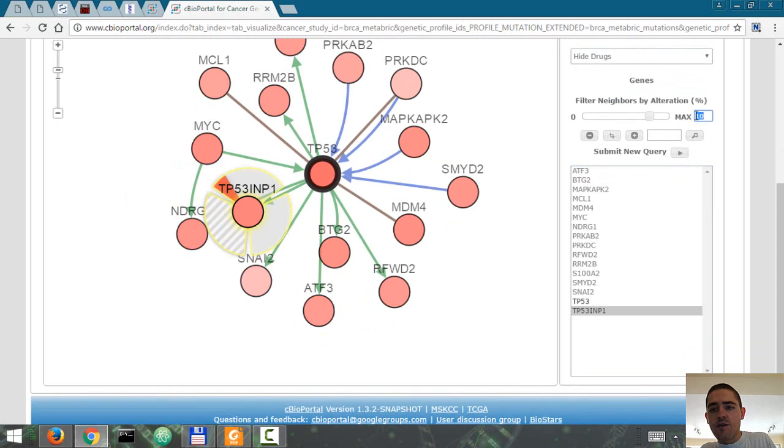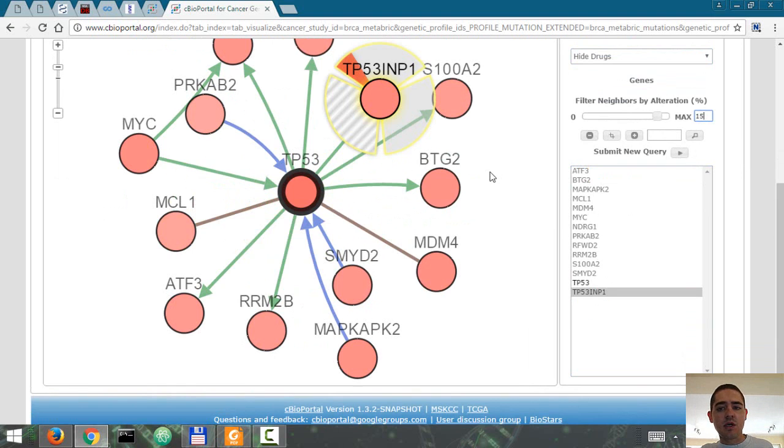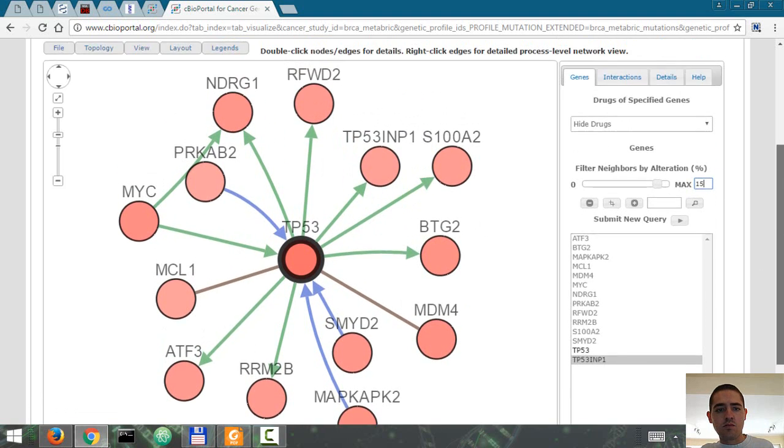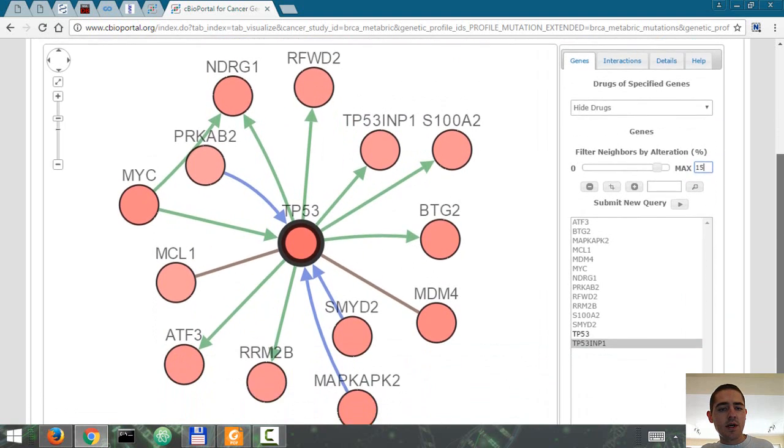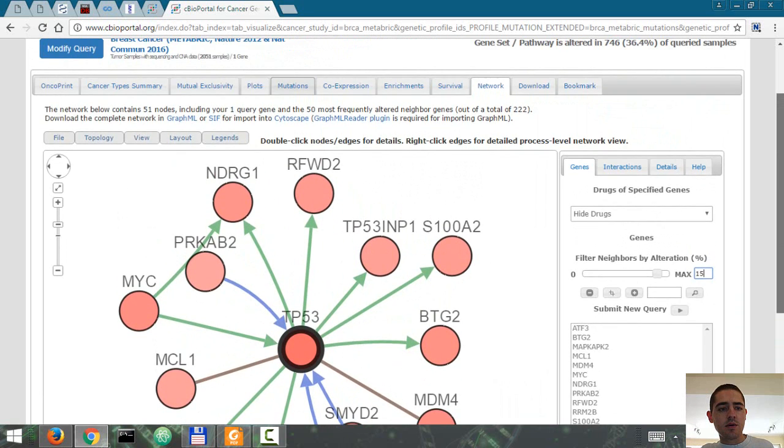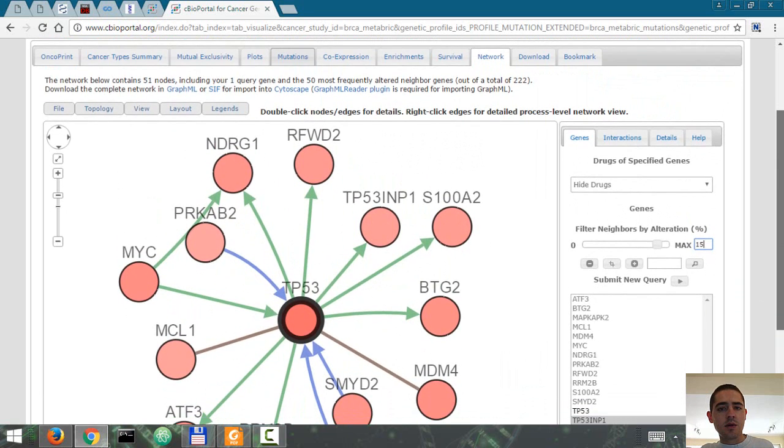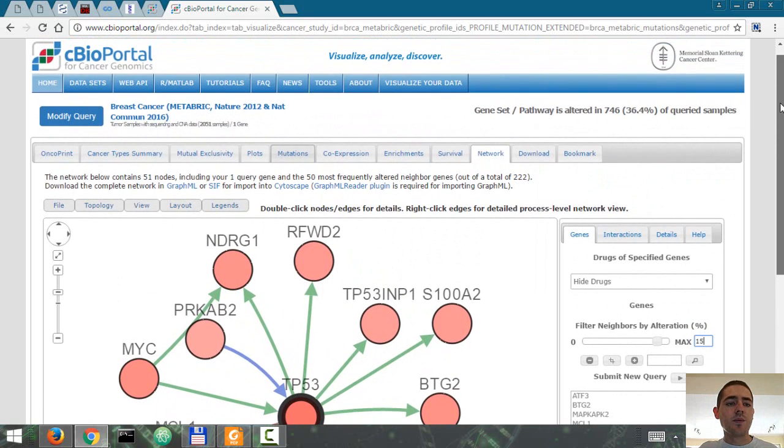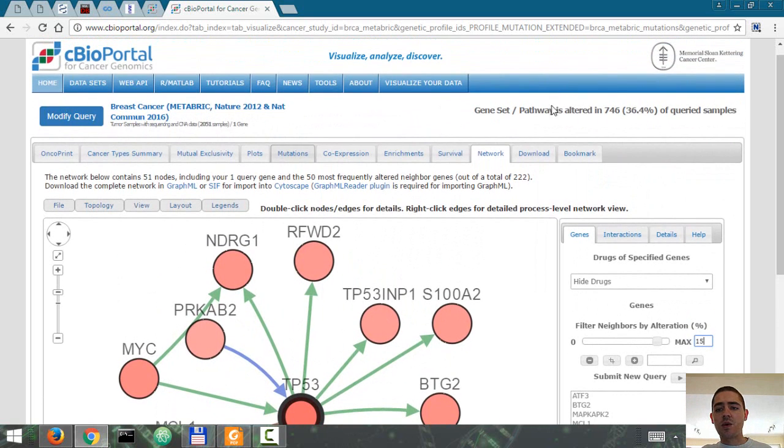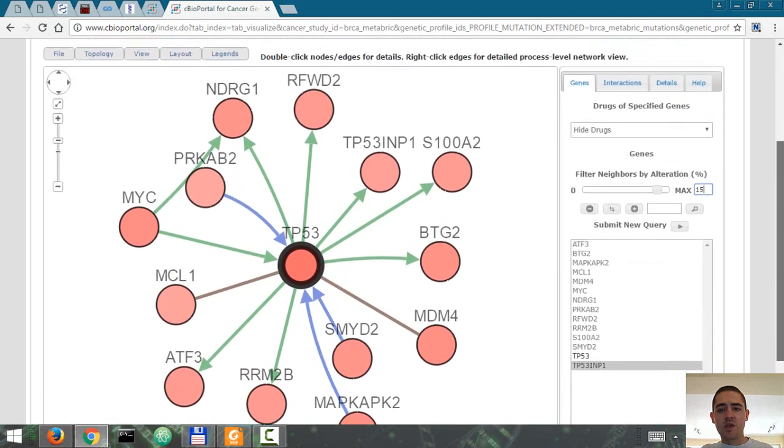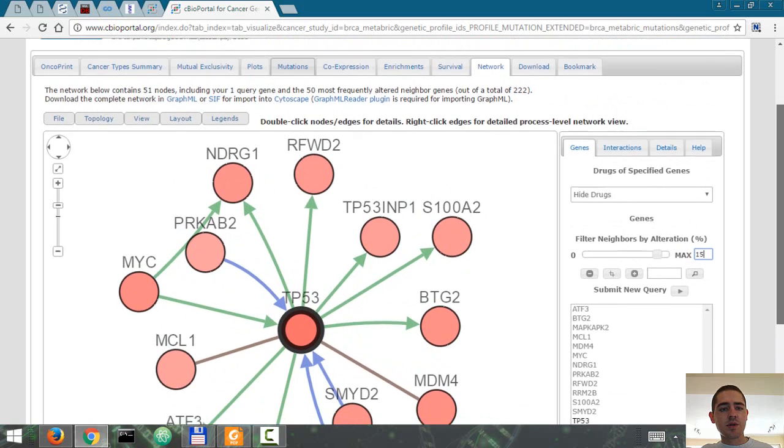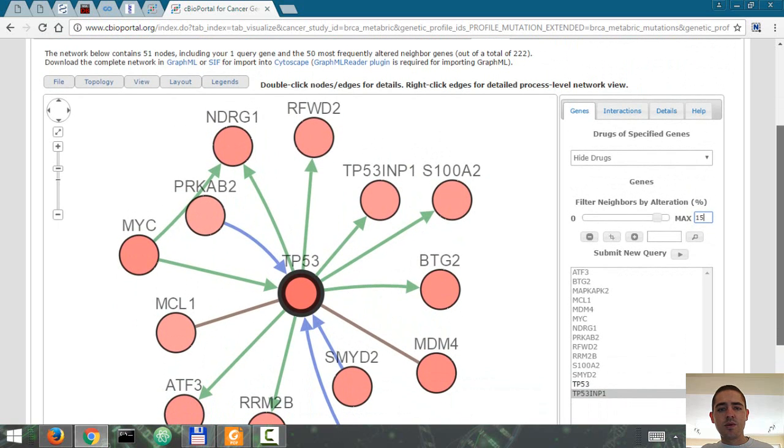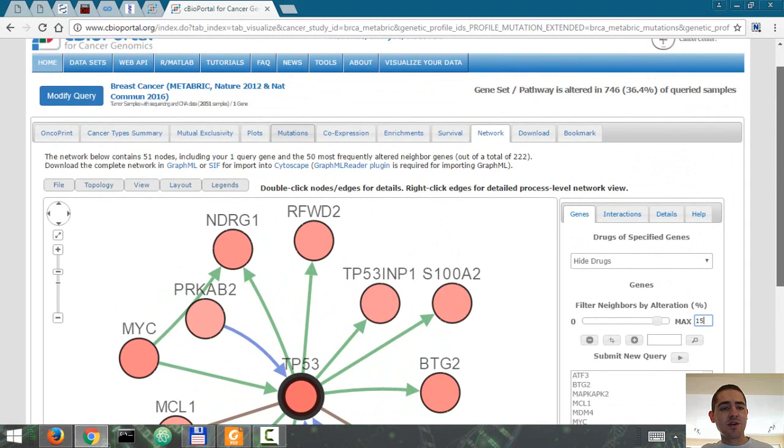You can go even further and look for genes that are mutated in at least 15% of the cases. Mostly the same. So yeah, you can do a lot of stuff with the data available on cBioPortal. This was just to show you some of what you can do here.